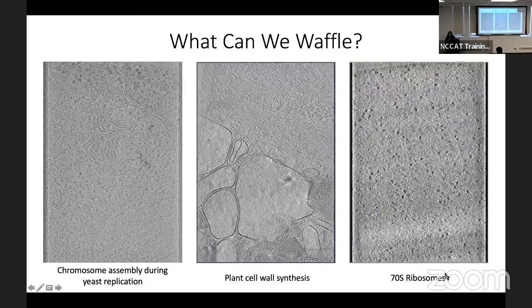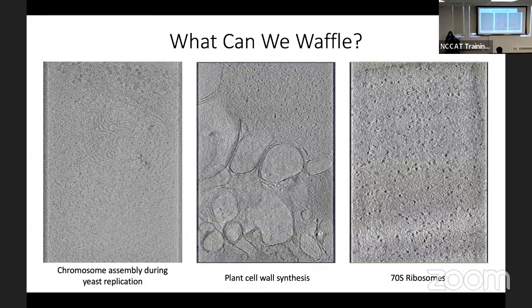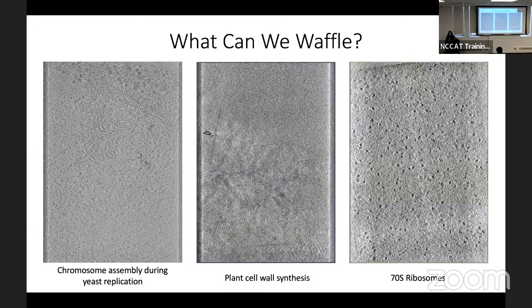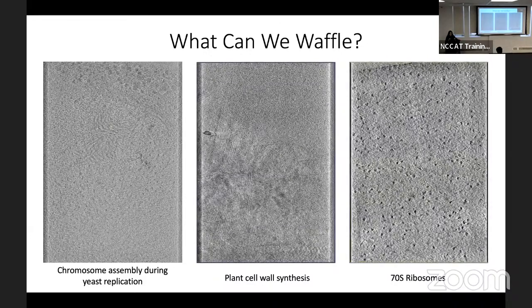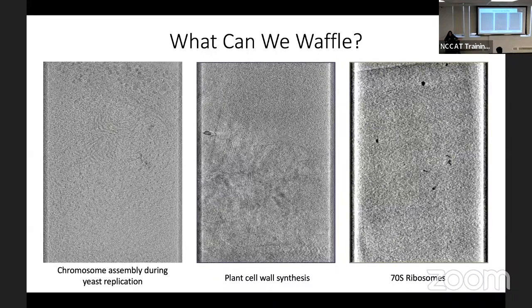If your protein keeps falling apart, air-water interface, preferred orientation, all that. This is a last resort, because this is painful to do, so you don't want to do it if you don't have to. But if you've got nothing else, you might as well try.